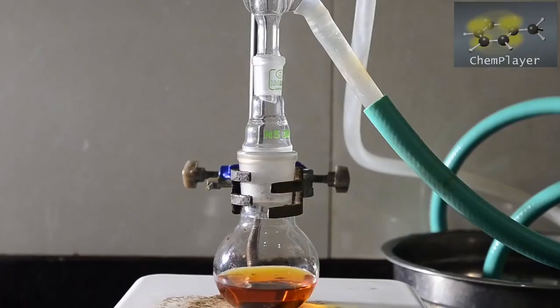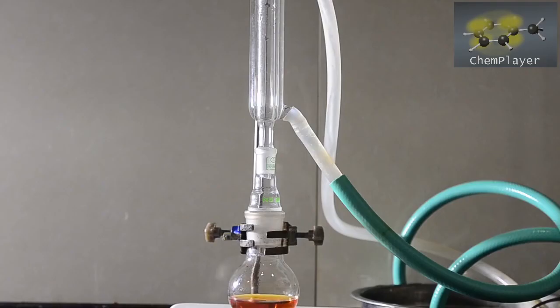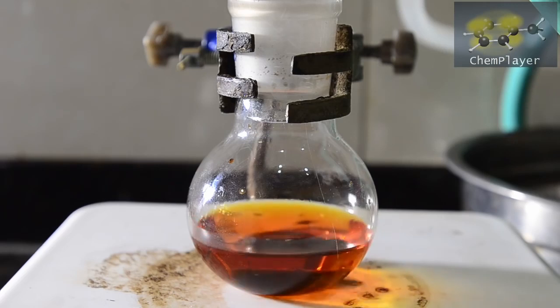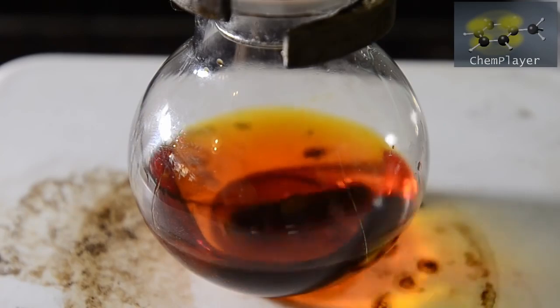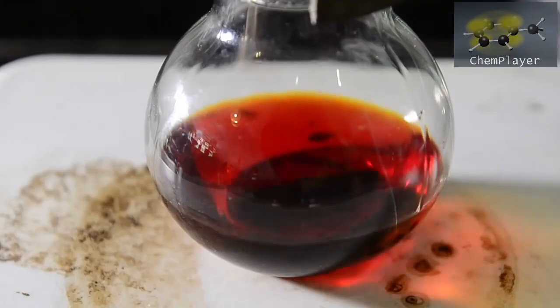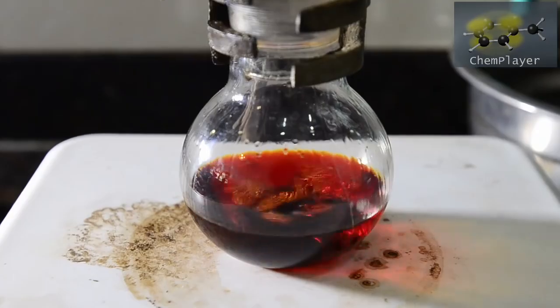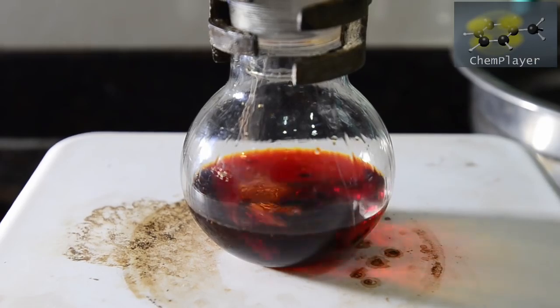We set the flask up on a hot plate and with a condenser attached so we can reflux the mixture. Pretty soon on heating, the mixture turns an orange color. And then starts to turn red. We heated to a gentle reflux, at which point the mixture had turned a beautiful cherry red color, as you can see.